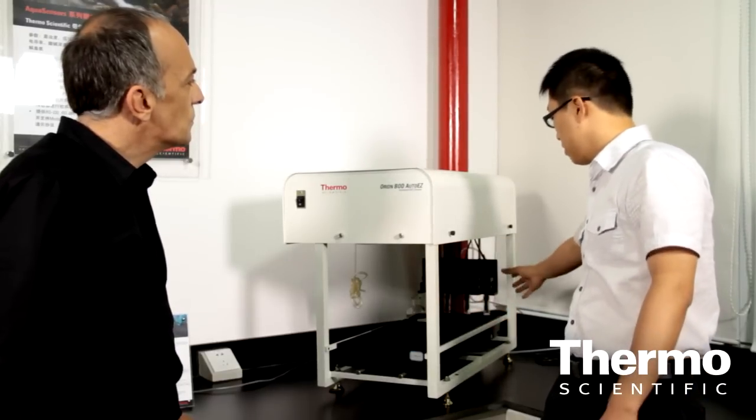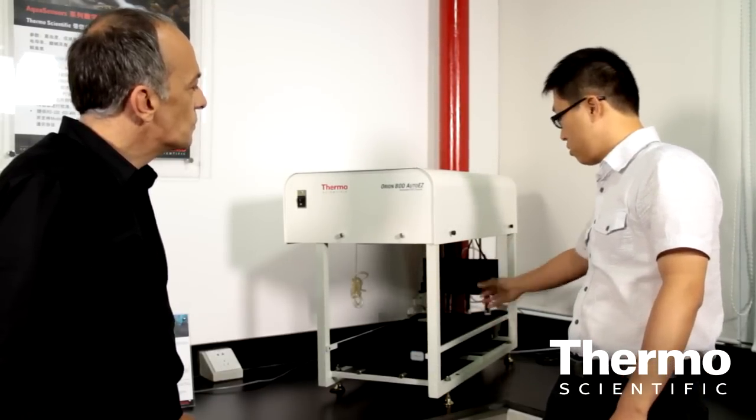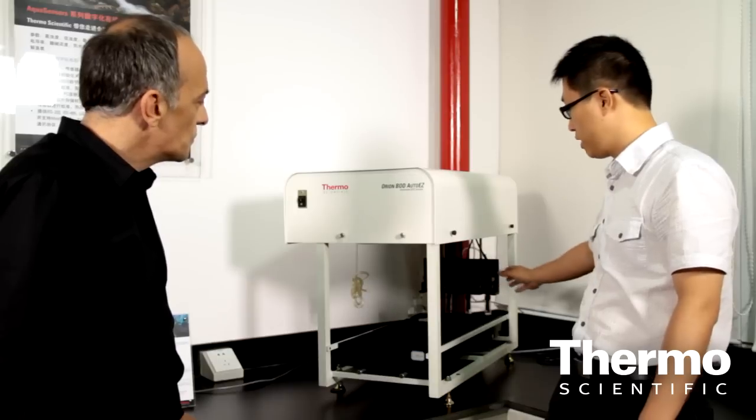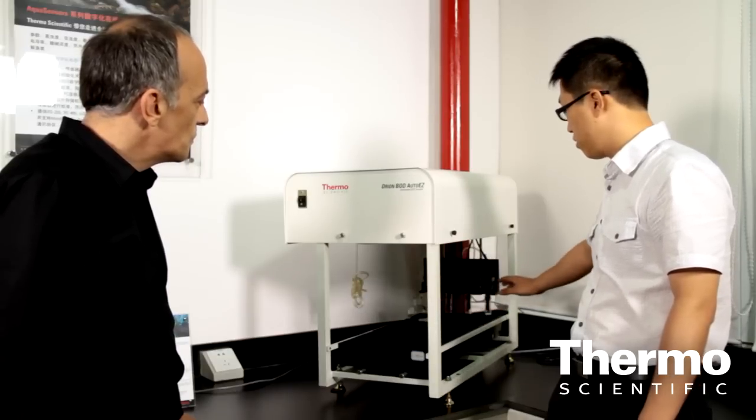With the four probes detecting line by line at the fastest speed setting, all of these 36 samples can be processed within 15 minutes.